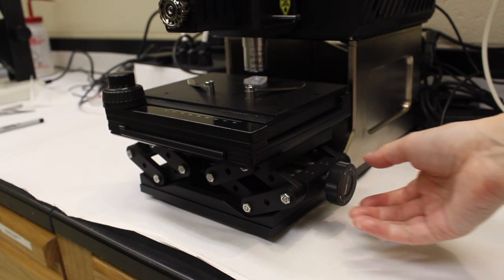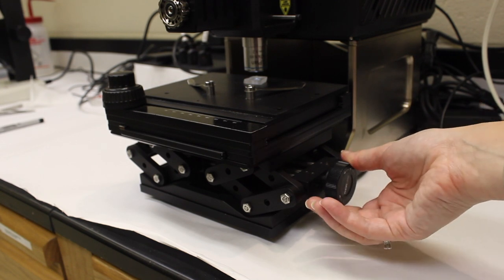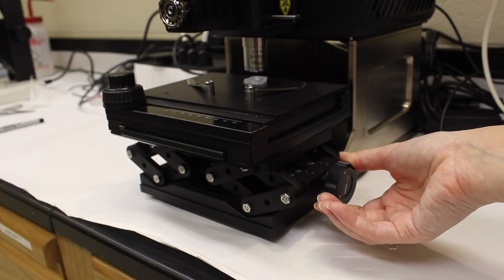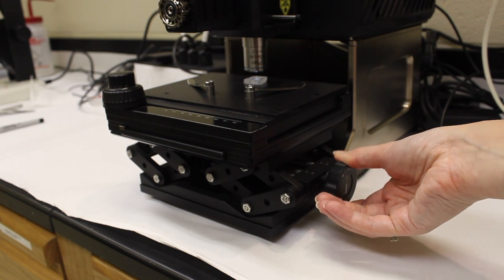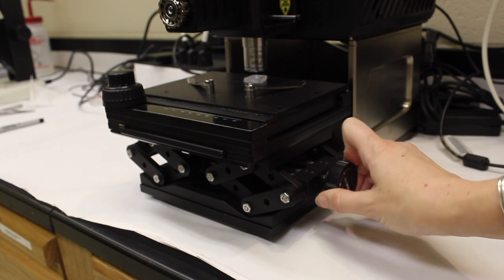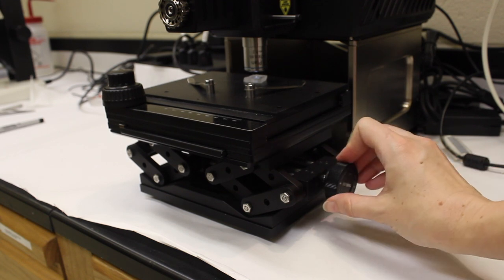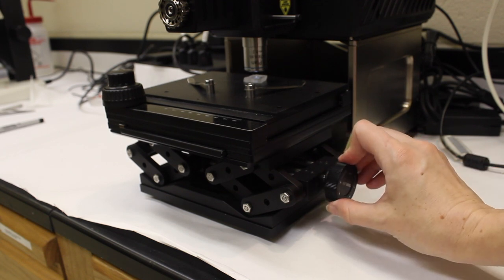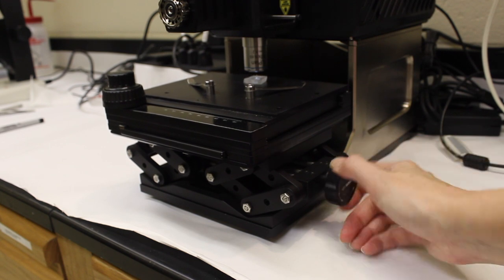To move the stage upwards to focus the sample, turn the knob on the side counterclockwise in the direction of the plus sign. To move the stage downwards, turn it clockwise in the direction of the negative sign on the dial.